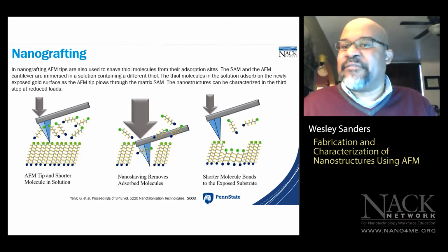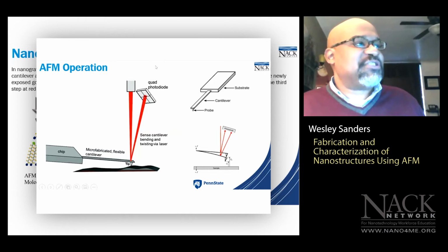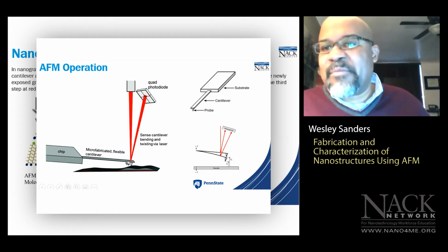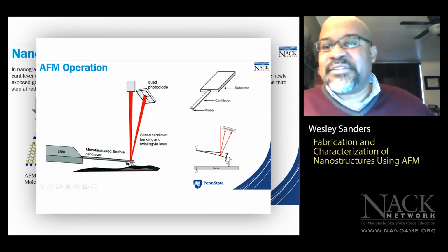So you don't use the laser at all? Right. So let me go at the laser. No, the laser is just used to track tip cantilever motion, because the cantilever is about 200 micrometers or 200 microns long, and the tip that's mounted on the underside at the end of the cantilever actually makes physical contact with the sample surface, right?